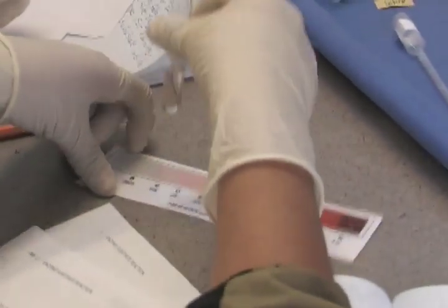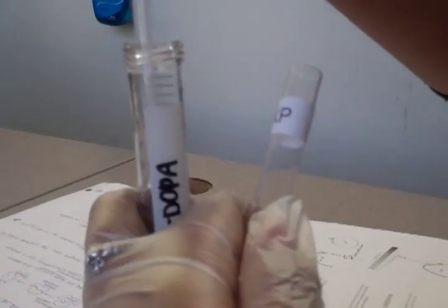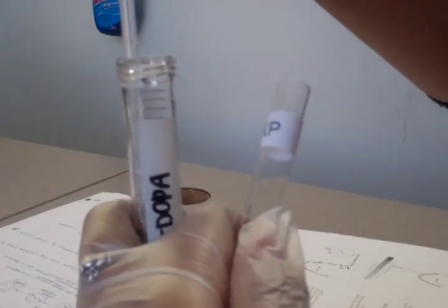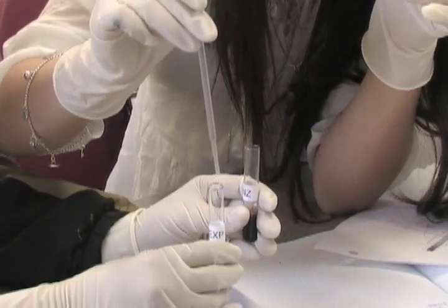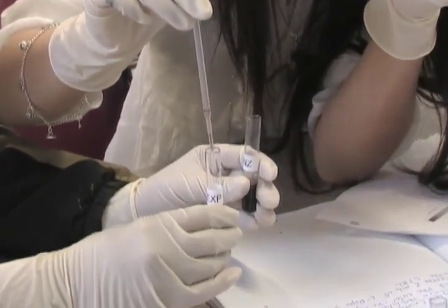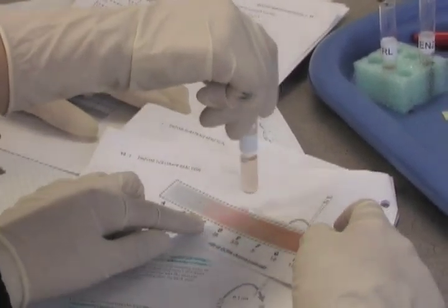By adding sodium benzoate, you can observe the effects of an inhibitor on the enzyme. Begin with adding 2 milliliters of the L-DOPA to your EXP test tube. Then, add all of the contents of the inhibitor tube to the EXP tube. I'm sure you realize what's coming next. Record your color change at time intervals. Then, add 0.1 milliliters of enzyme to the tube and continuously mix. Record your color changes, but remember to mix the entire time.